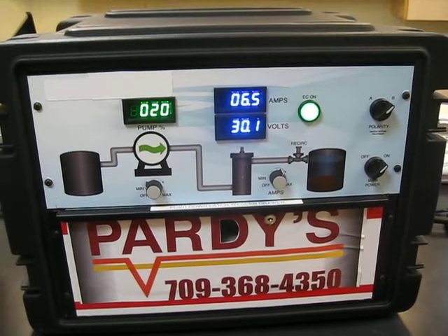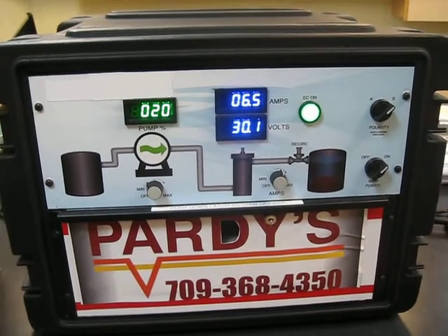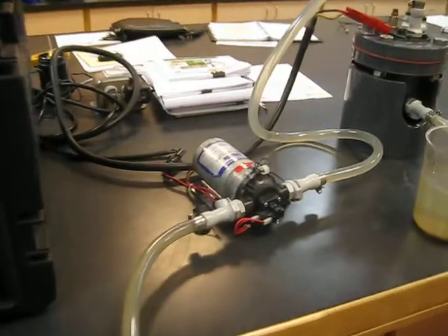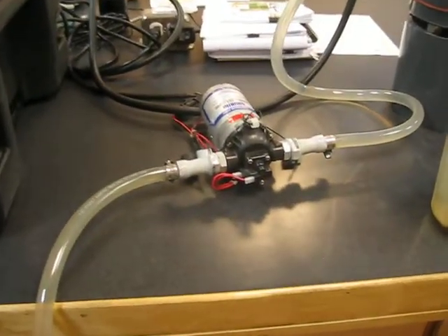And we can also alter the direction of current flow through the cell from the panel. We're pumping the fluid with the pump, a small diaphragm pump.